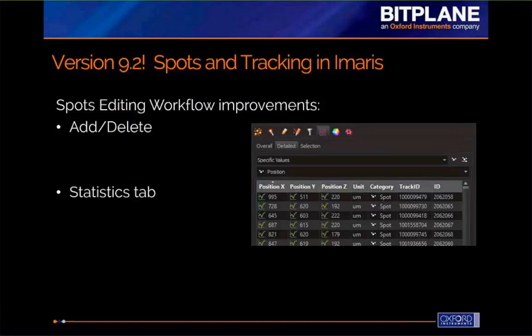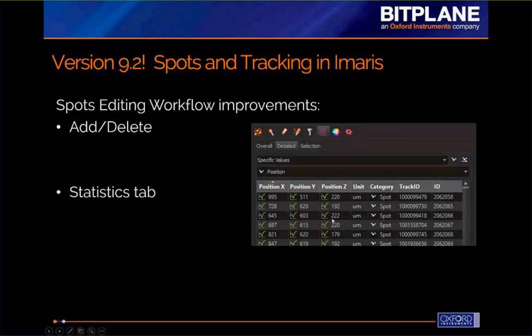The second place where you'll see an incredible speed improvement is on the statistics tab. This is where Imaris presents tables where you can pick the measurement you're interested in and see the values — for example, position — listed for each spot. For a time-lapse with millions of spots, there's a huge amount of information to organize within these tables. Through reworking of this tab, the tables now pop up much more quickly and are much more interactive, with significantly faster responsiveness.